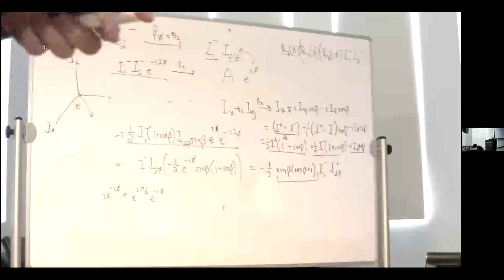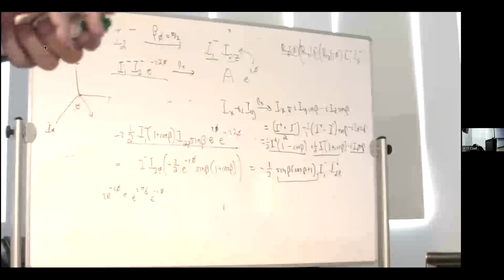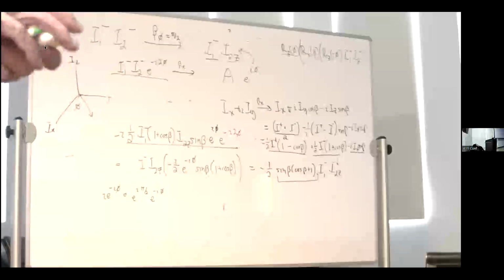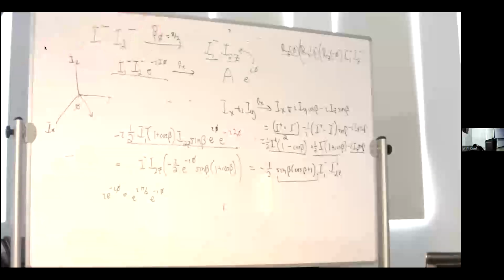And I realized after pages of trigonometry that I could never maximize the term I wanted, but the biggest artifact term could be made equal to 0 by picking a particular value. In that case, it was couplings, not pulses, but picking a particular value of T didn't give you the most of the operator you wanted, but it nulled the one you couldn't get rid of in any other way.